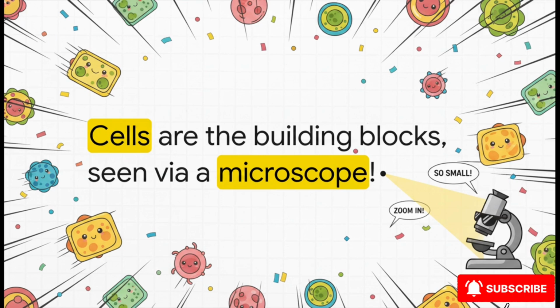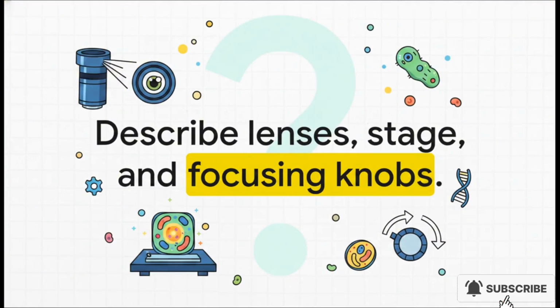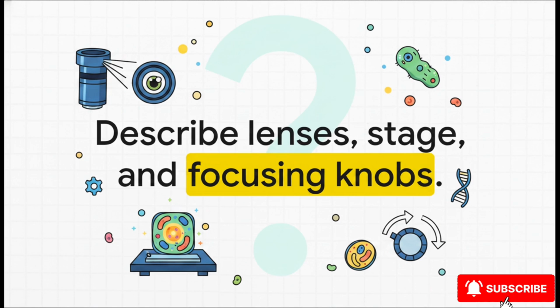They are the fundamental building blocks of life, making up everything from single-celled bacteria to, well, you and me. And because you can fit 100 of them across a tiny full stop, the absolute only way we can observe them is by using our essential tool, the microscope. Let's try another one. Can you remember the anatomy of that microscope we just looked at? Try to describe the specific jobs of the lenses, the stage, and the focusing knobs.